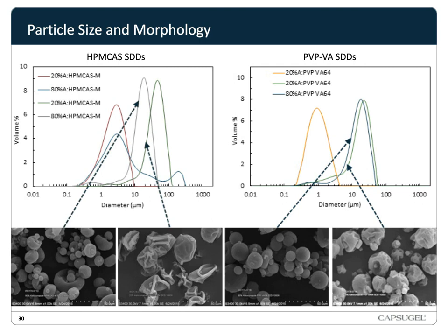Although it's not shown here, the BET measurements for the different surface area ones were about an order of magnitude different for the same formulation. So the 20% active HPMCAS-M formulation with the high surface area was an order of magnitude higher than the 20% active HPMCAS formulation with the low surface area. The only difference there is how we atomized it and the drying conditions in the spray dryer.